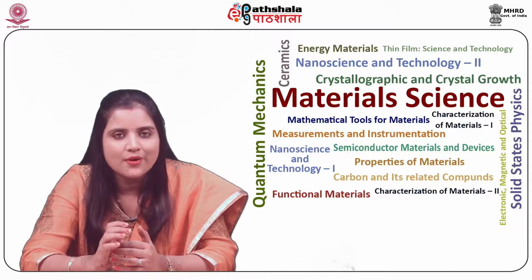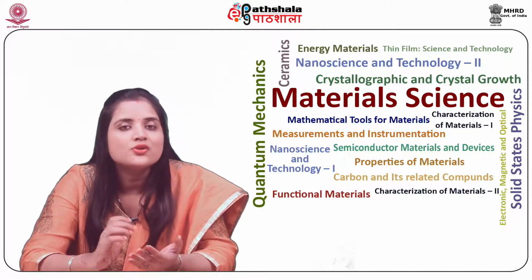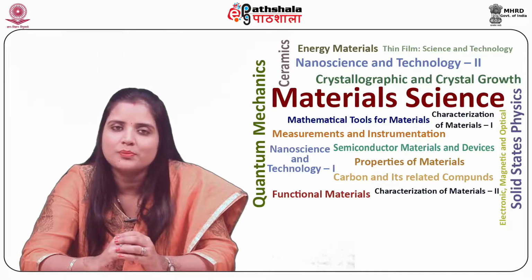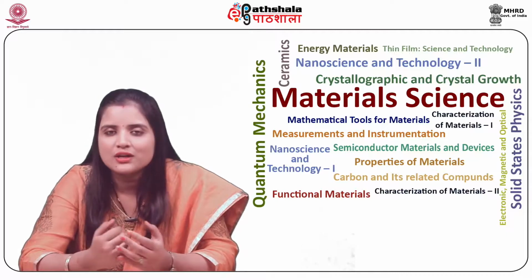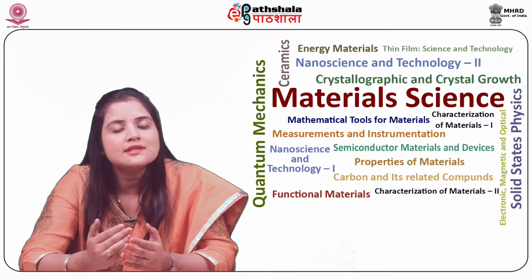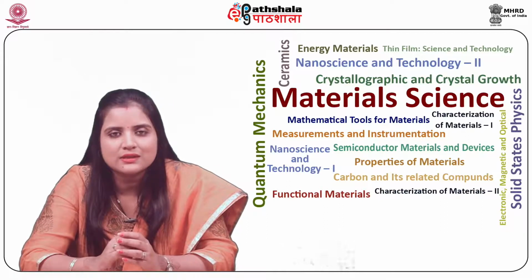Pulse processor now. It is a charge sensitive preamplifier which is employed to convert the charge pulse to a voltage pulse. We next discuss the analyzer. A multi-channel analyzer is used to sort pulses by voltage in the signals which are received by the analyzer.